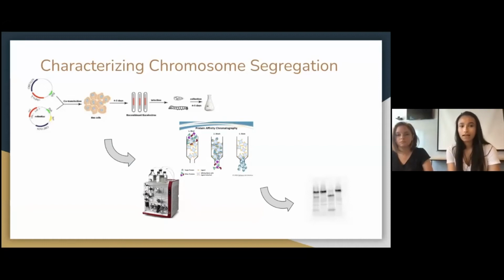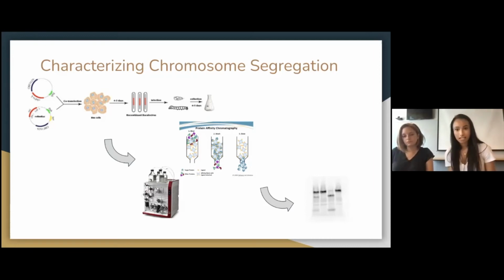After we harvest those cells that are expressing these proteins, we then need to purify them with a system called the ACTA. Basically the ACTA has a bunch of different protein affinity chromatography columns. These columns are filled with a bunch of beads that have molecules attached to them that will bind to a specific tag that we've encoded with the protein that we have produced through the baculovirus expression system. So we're able to catch the proteins that we want using their tags on these beads in the column. And then we're able to elute them with a competing molecule and an elution buffer that allows us to extract the protein off of these beads.